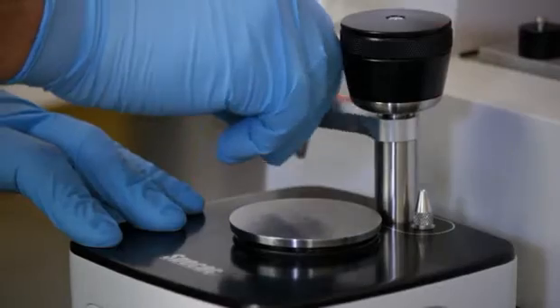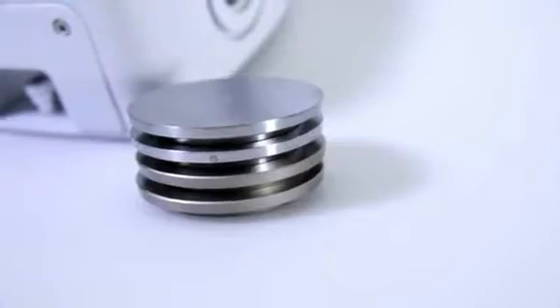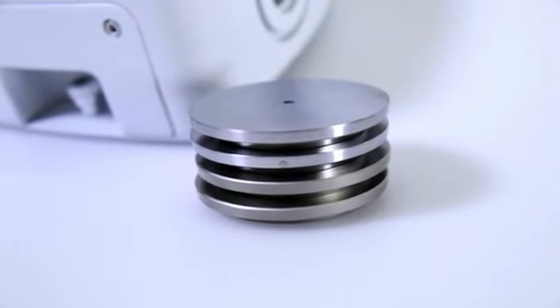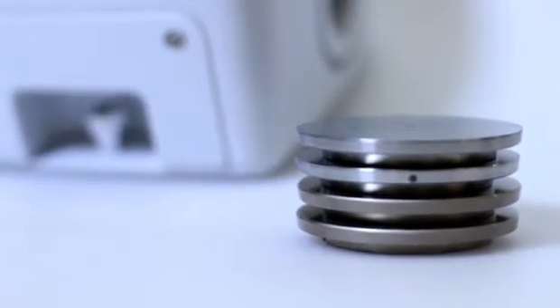A choice of four crystal pucks are available for the Quest including two configurations of strong and durable monolithic type 3 diamond, a zinc selenide and a germanium crystal option.